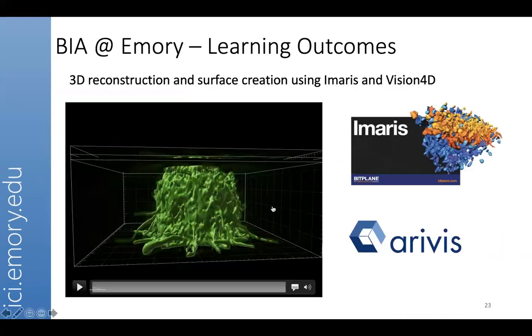Apart from that, we will also be looking at different tools which can help you with 3D reconstruction. Now, these are not free tools.